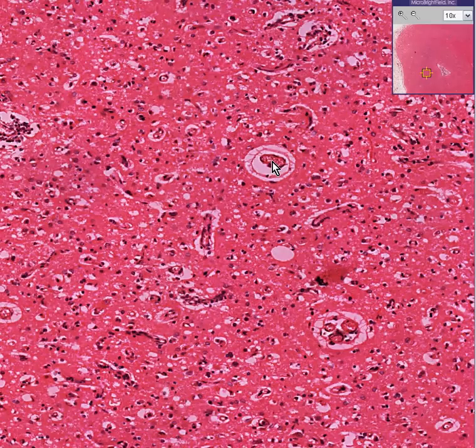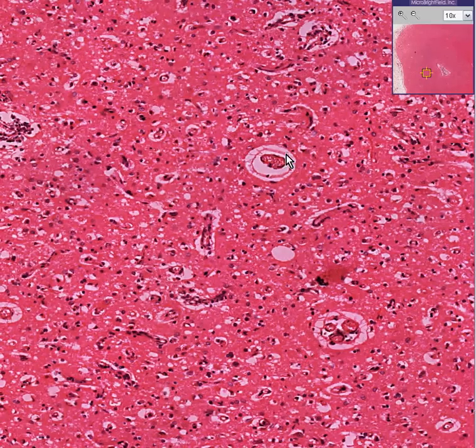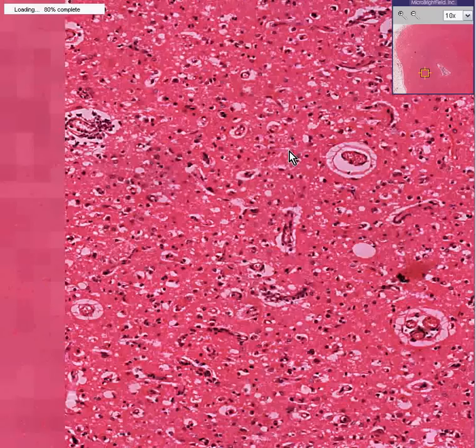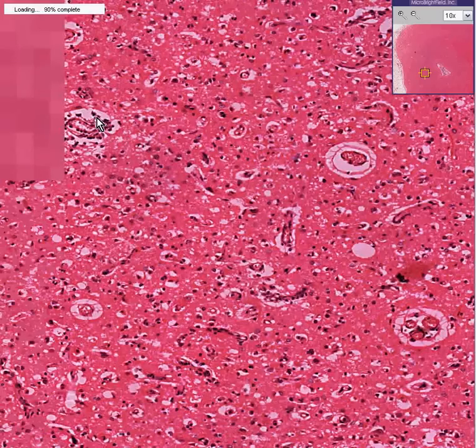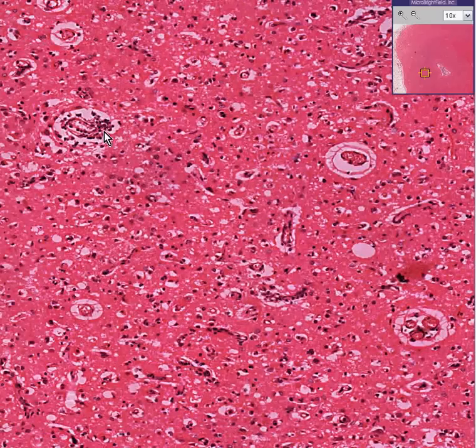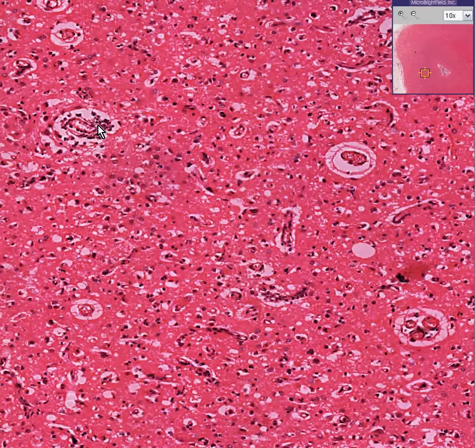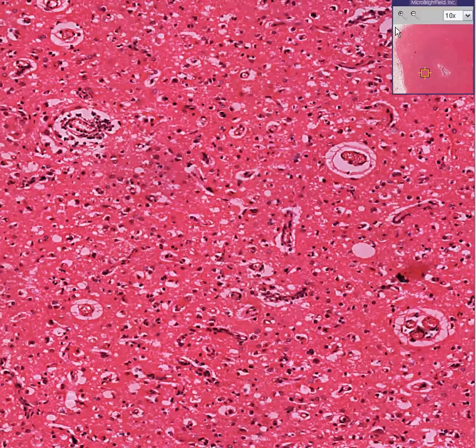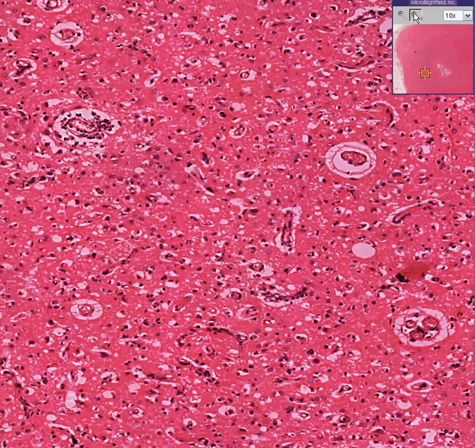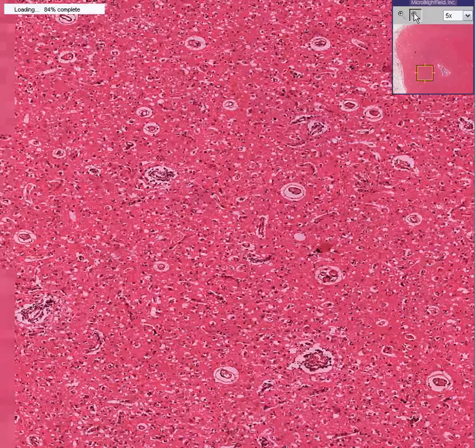We have prominent standing out blood vessels. And lo and behold, in some of these blood vessels, you appear to have a little cuff of inflammatory cells, almost like an encephalitis, like you see classically with the viral encephalitis.